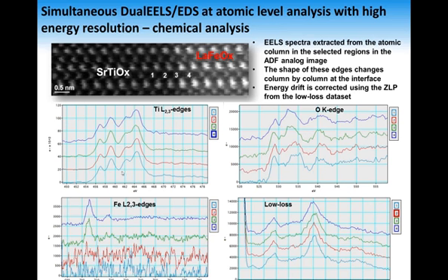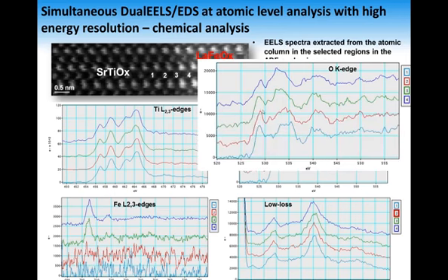you can look at the titanium. You can see a pretty nice result. With titanium, you see all these 4 peaks, so you can tell whether you have titanium 3+ or titanium 4+, and titanium seems to stay 4+ across the entire interface. So for the titanium, we actually see elemental diffusion. We see titanium diffusing into the interface, but the titanium doesn't change its coordination. So chemically speaking, the titanium remains unchanged. If you look at the oxygen, you can see pretty big changes across the interface.